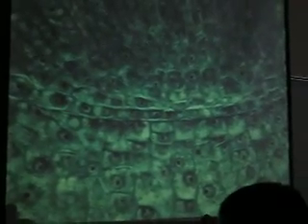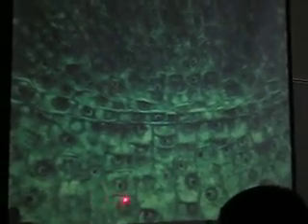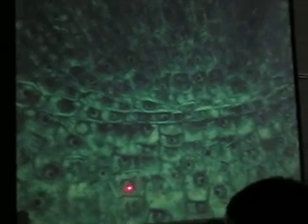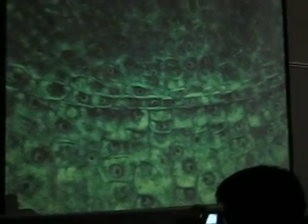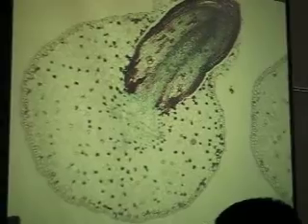But if you really want to get up and close, there's 40. See, that's one cell. That's the nucleus, and the red dot is the nucleolus. All right, and there's the meristem area. Now, if you go up a little bit higher, you notice the cells are what? Elongated, right? You're in the zone of elongation up the root.